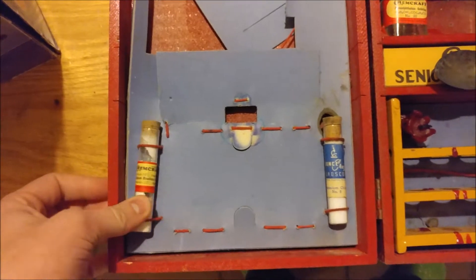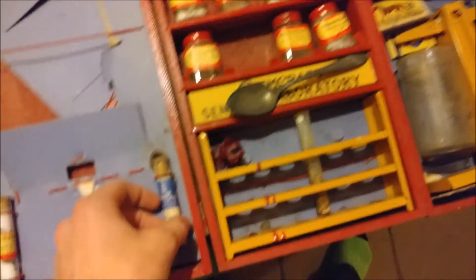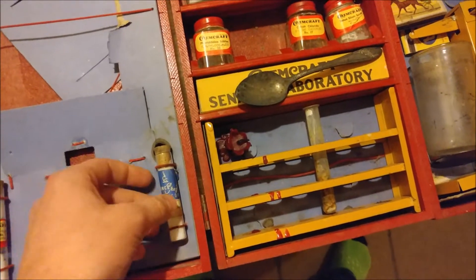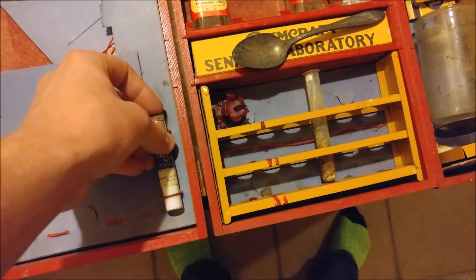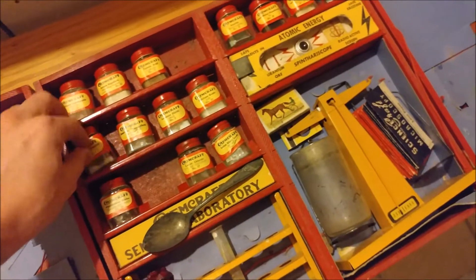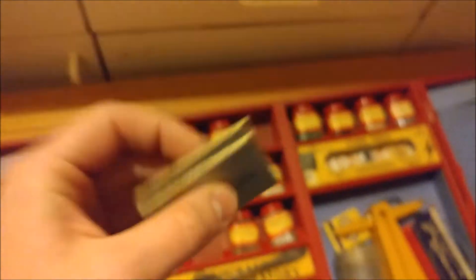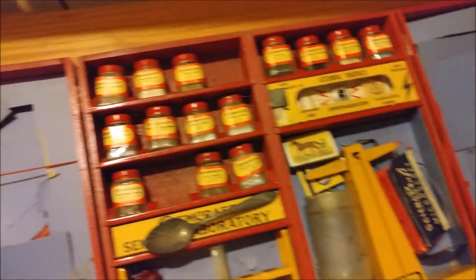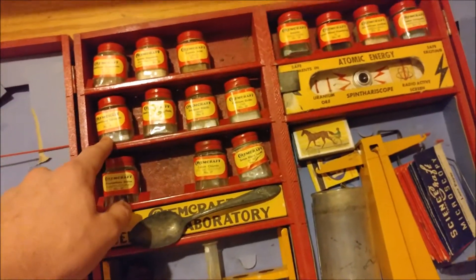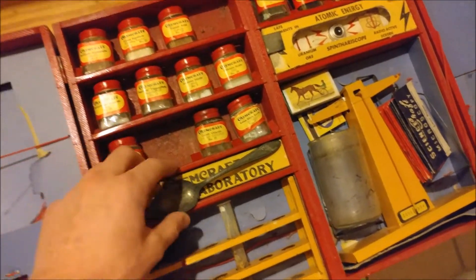We have some sodium bisulfate. Keep in mind, I'm new to at-home, do-it-yourself chemistry, so I don't know exactly everything yet. Ammonium chloride, strontium chloride — this is going to be pretty interesting. I don't know if the strontium here will actually give off a radiation signature. I have a friend who has a Geiger counter, so I can borrow it. The matches are from 1955, so the kit must be from the 50s at least. It's gone through its half-life three or four times, so if there was any radioactivity in there, there might not be a lot left.